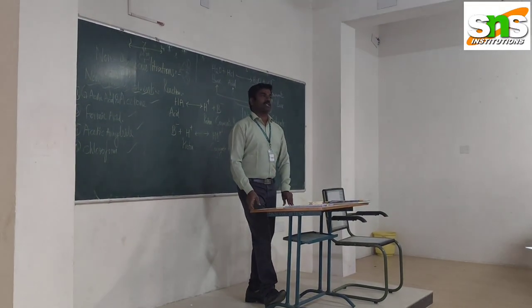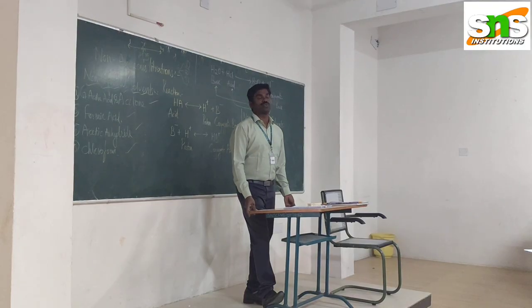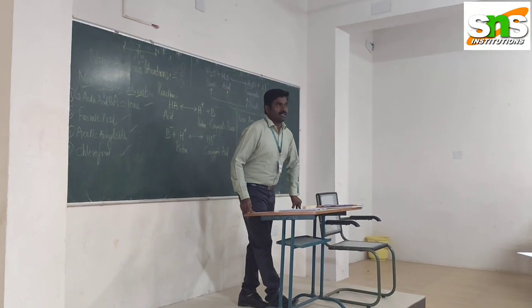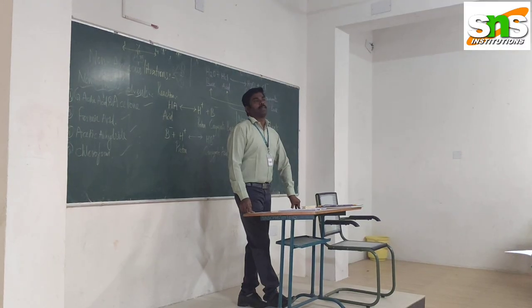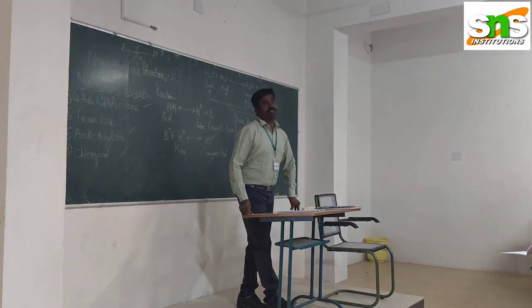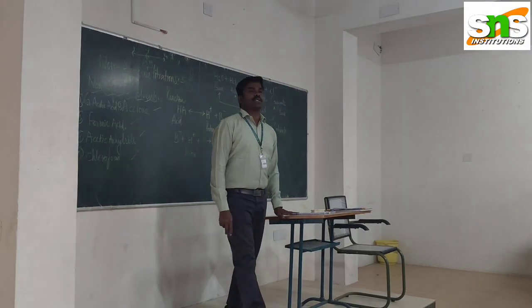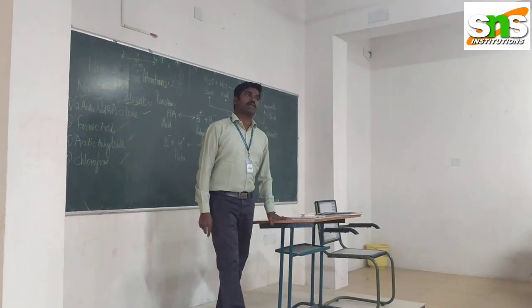So this non-aqueous titration technique is very suitable for the majority of synthetic drugs. It has three major limitations based on which we select this non-aqueous titration technique.